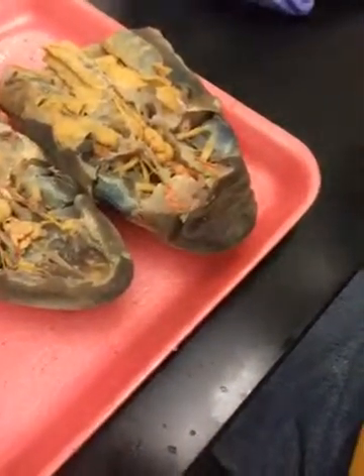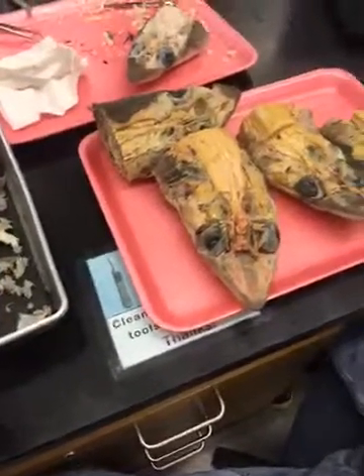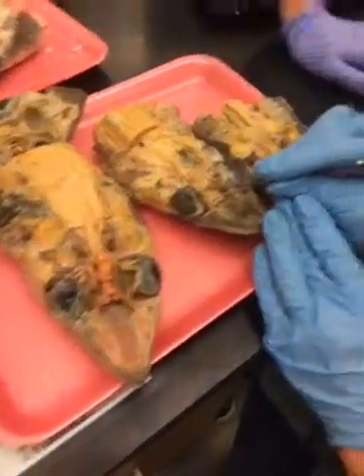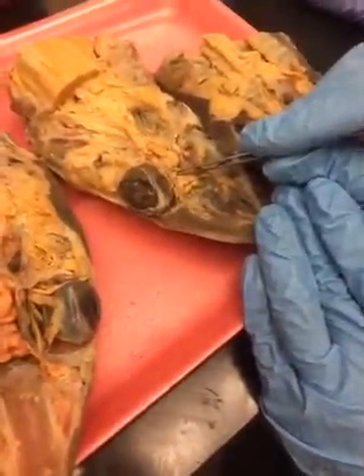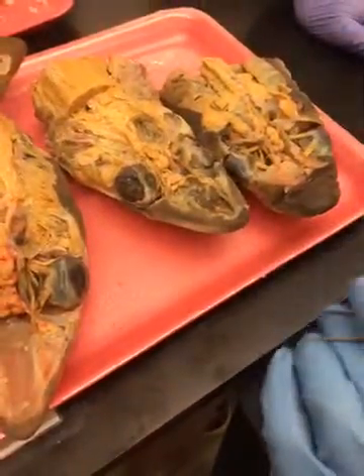That's called telechoroidea. So the epithalamus is composed of telechoroidea. Now, if you rip through that telechoroidea right here, you go into a cavity, which is the third ventricle. So obviously, there are lateral ventricles in either cerebral hemisphere.